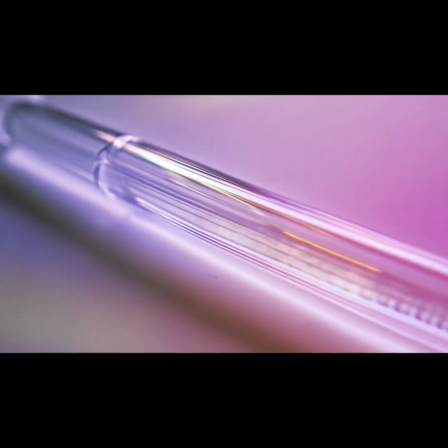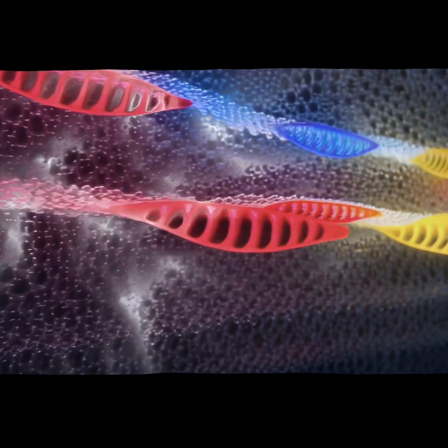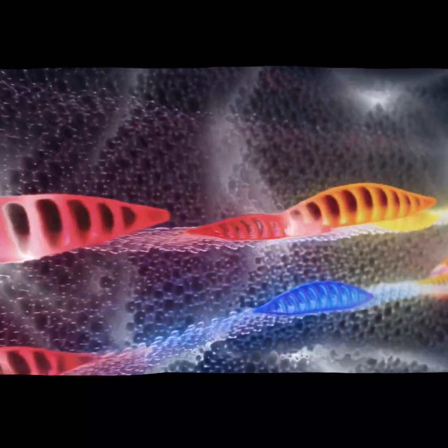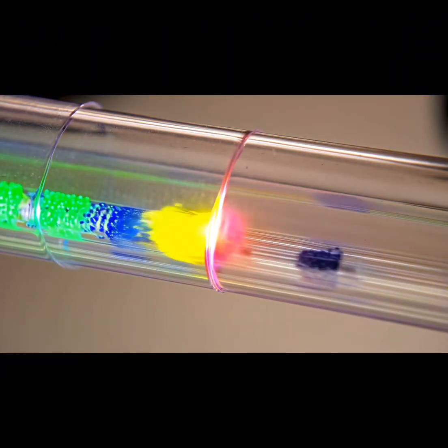Temperature affects fragment migration speed, so it must be carefully controlled. If too high, the polymer becomes too flexible, reducing resistance and causing DNA fragments to migrate too quickly. If too low, the polymer becomes too stiff, increasing resistance and preventing proper separation. As DNA fragments sieve through the capillary polymer, they separate by size. Smaller fragments reach the detector first, while larger ones pass through last.